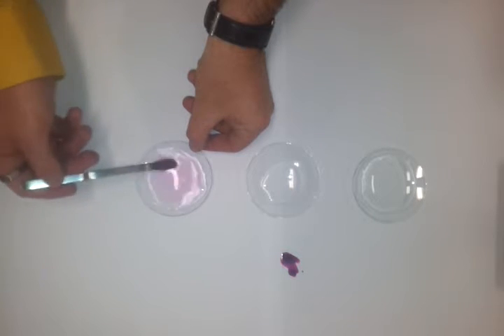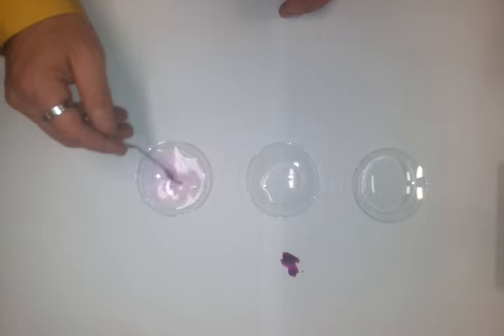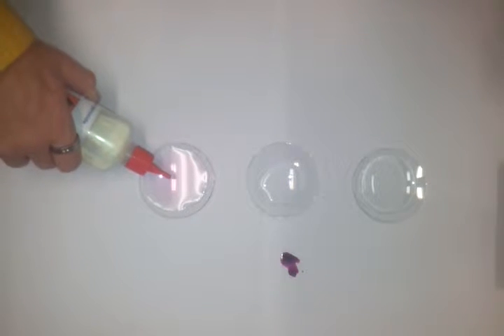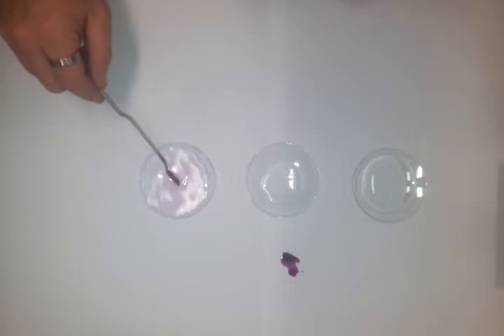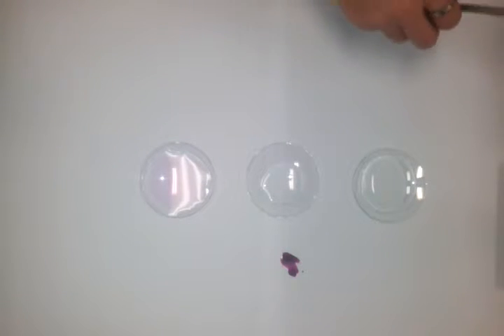It goes from being purple to an extremely pale pink, and then if I've got enough peroxide in there, which maybe I don't, then it will decolorize. So that's our first redox reaction, the one that we probably remember from last year, where the permanganate decolorizes.